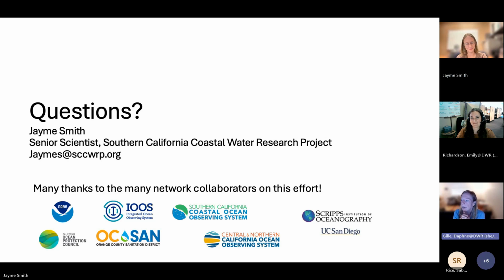We are interested in an IFCB, and it's along the same lines as what Emily was talking about. If we're collecting samples in the field and we need to bring them back to the lab and we're running the IFCB in benchtop mode, first of all, how long do we have between sample collection and when it needs to be run in benchtop mode in the lab? And then how long would it take to run per sample? I know it probably depends on how much volume you collected and what's in the sample, but just a ballpark would be helpful.